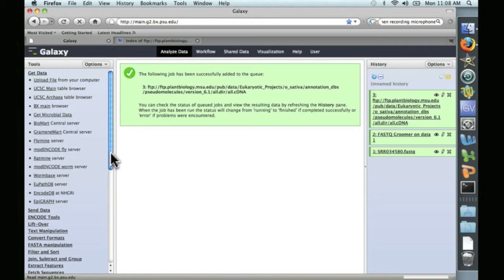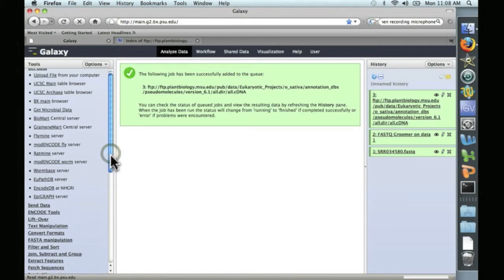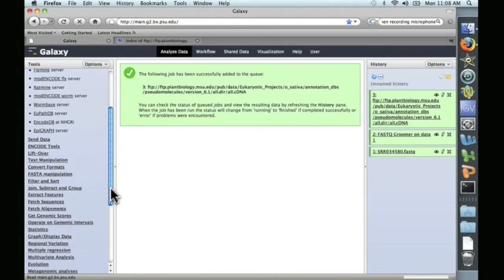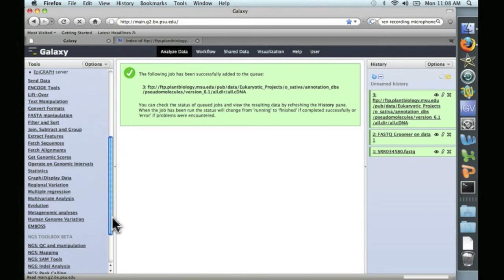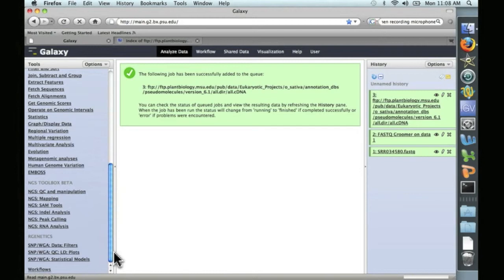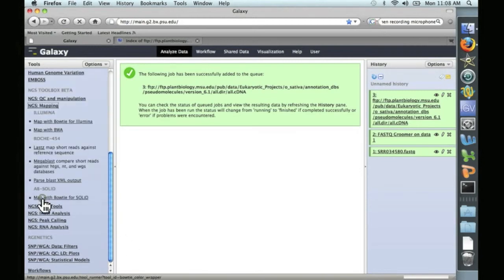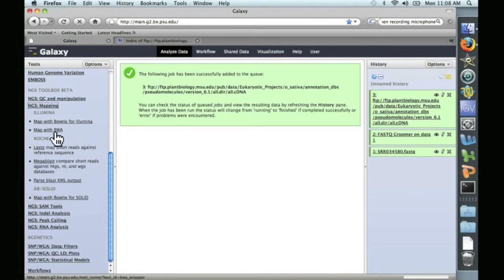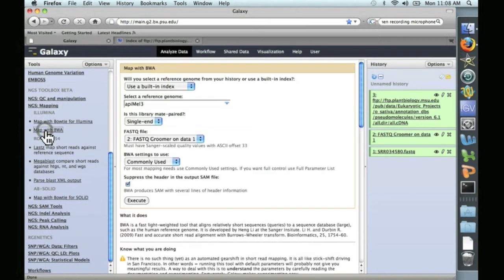So we're going to scroll down here on the left. Under Next Generation Sequencing, we're going to go to Next Generation Sequencing Mapping. And we're interested in this one: Map with BWA, Burrows-Wheeler Alignment. Open that up.